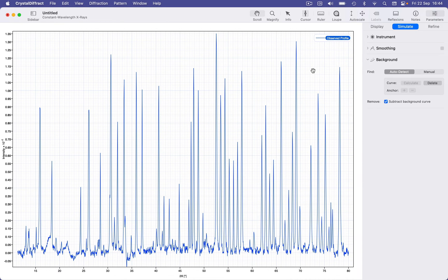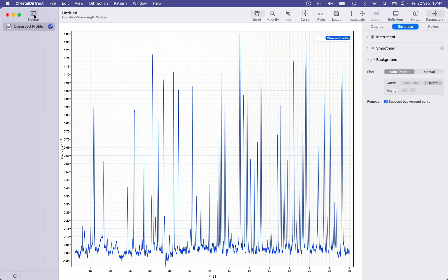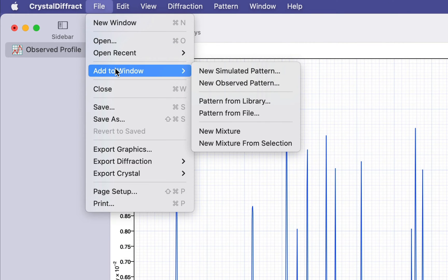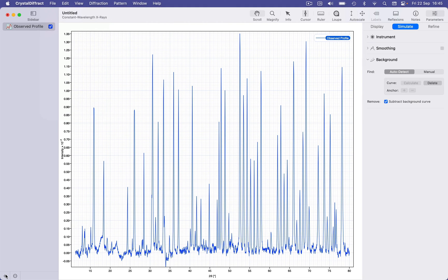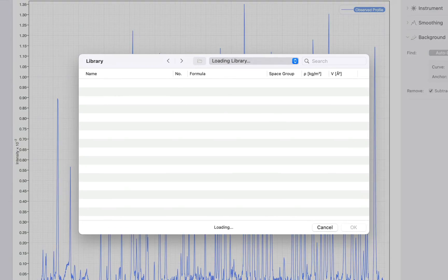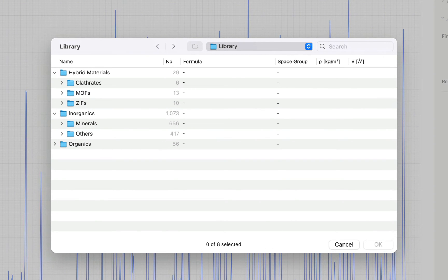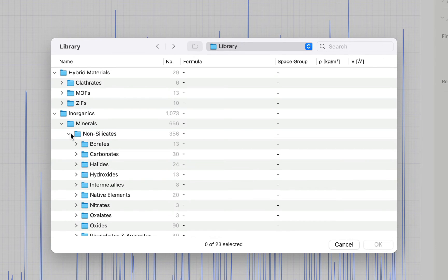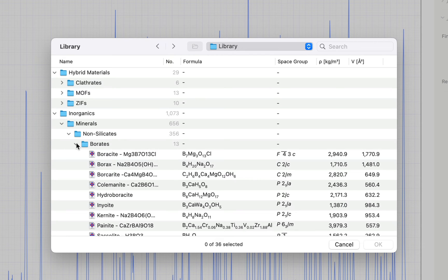Once we have our cleaned-up data set, we can compare it with ideal simulated diffraction patterns to assess sample integrity and purity. We can take advantage of CrystalDiffract's integrated structures library to do this. I'm going to add reference patterns for two phases: the source material Zeolite Analcime and Silicon, the latter being an internal standard. We can use the File > Add to Window submenu, or the Add button in the sidebar. The library browser appears in list form — we could browse all phases, but it's actually faster to search.